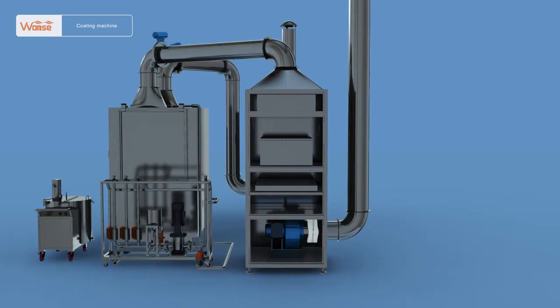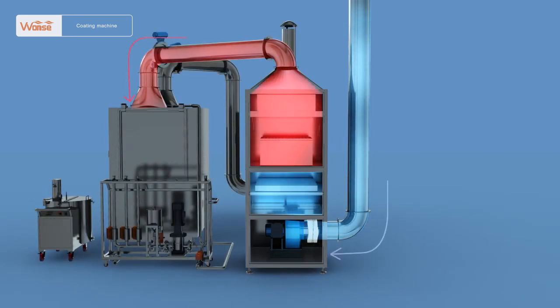The hot air needed by the main machine is natural air from outdoors. After going through primary efficiency and medium efficiency filtration, the air will be heated to the set temperature by the steam or electric heating heat exchanger.